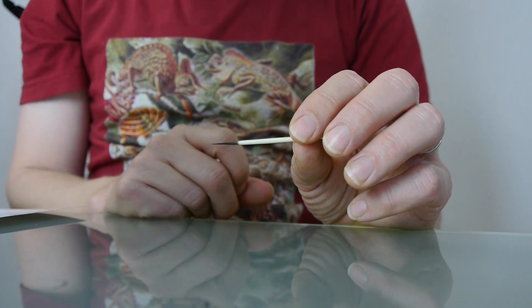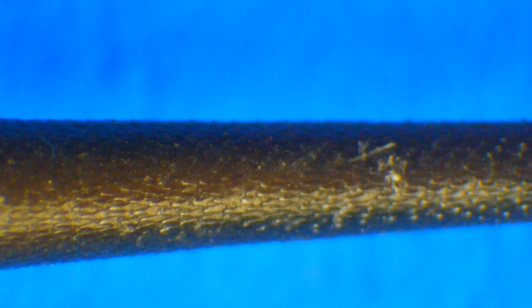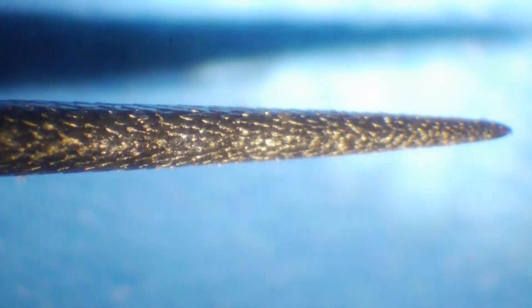It doesn't bend very easily — you can bend it a little bit, but it stays straight when you touch the tip, and that allows it to poke into that animal. If we look a little bit closer through this microscope at that brown tip, you will see that there are tiny little scales that lay down over top of each other and point toward the root end of the quill.